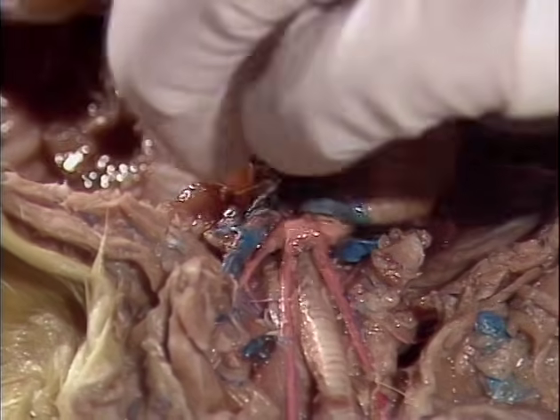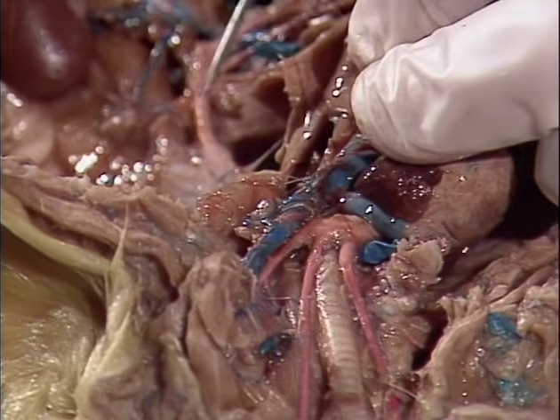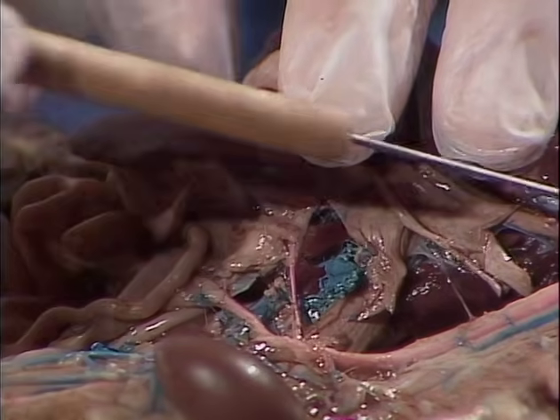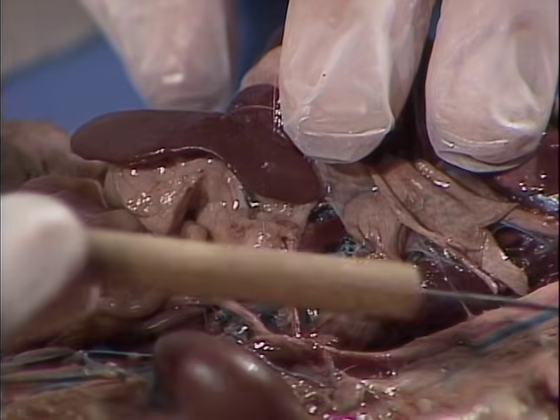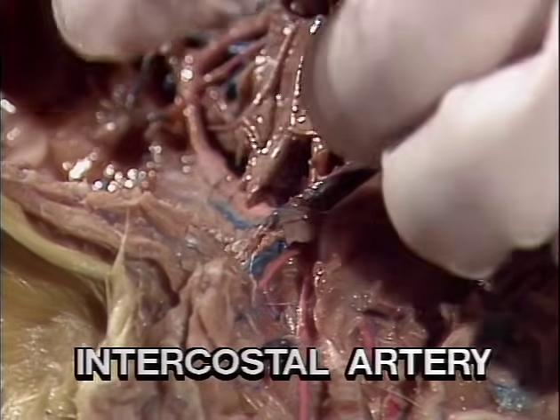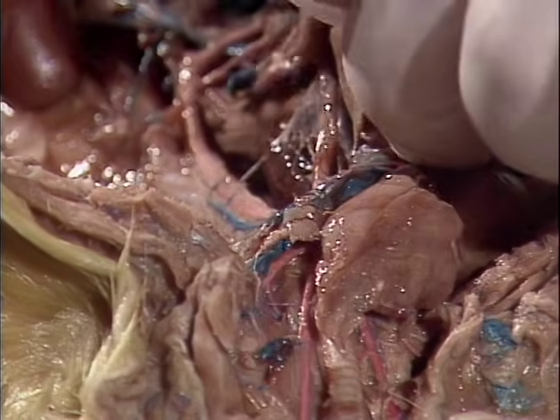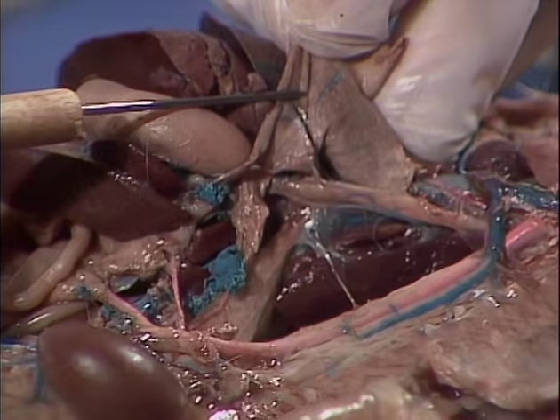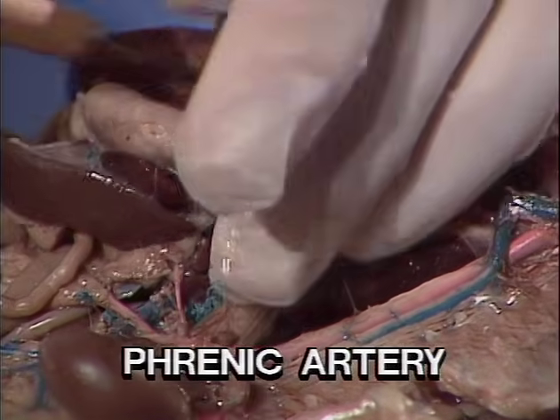As the dorsal aorta goes towards the tail region, we see many branches branching off of it. One of these branches goes into the ribs and is known as the intercostal artery. Another branch will go into this muscular tissue, which is the diaphragm. That artery is called the phrenic artery.